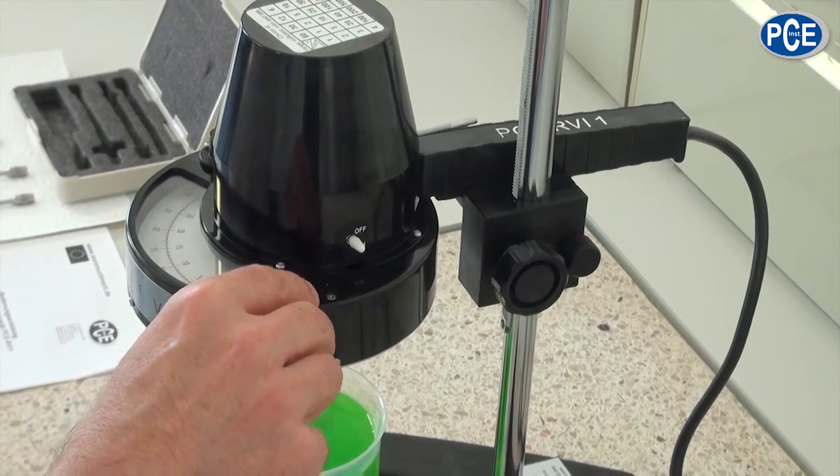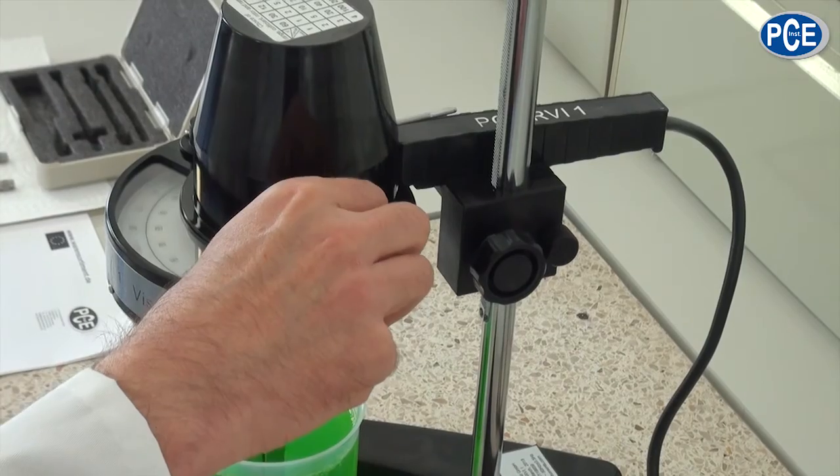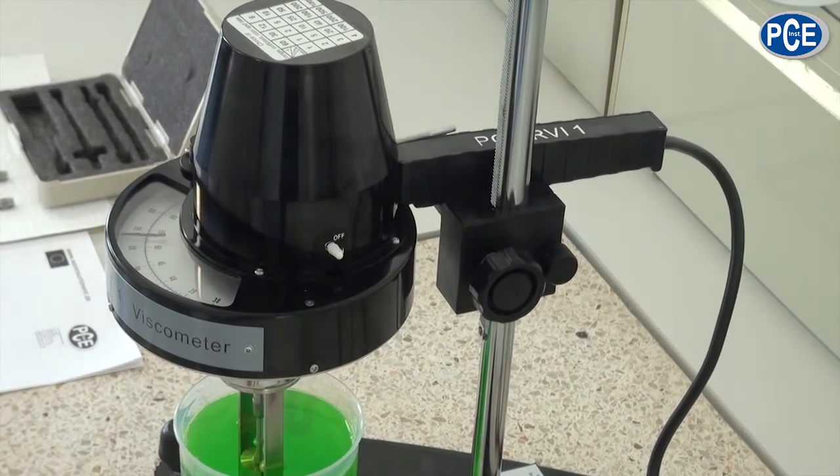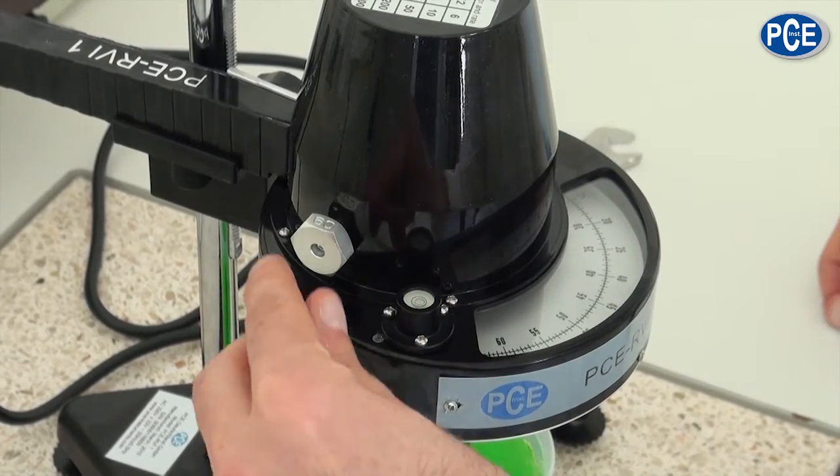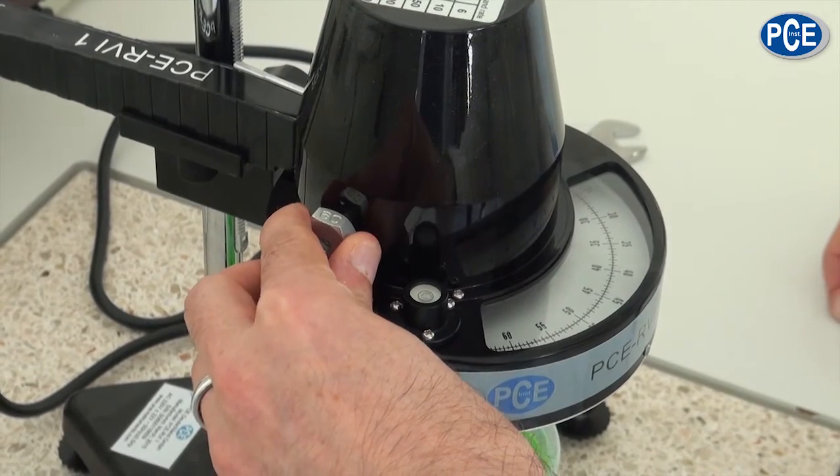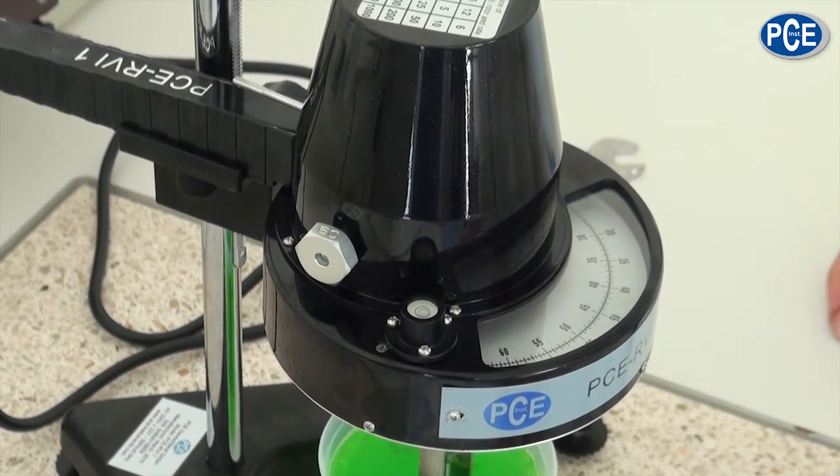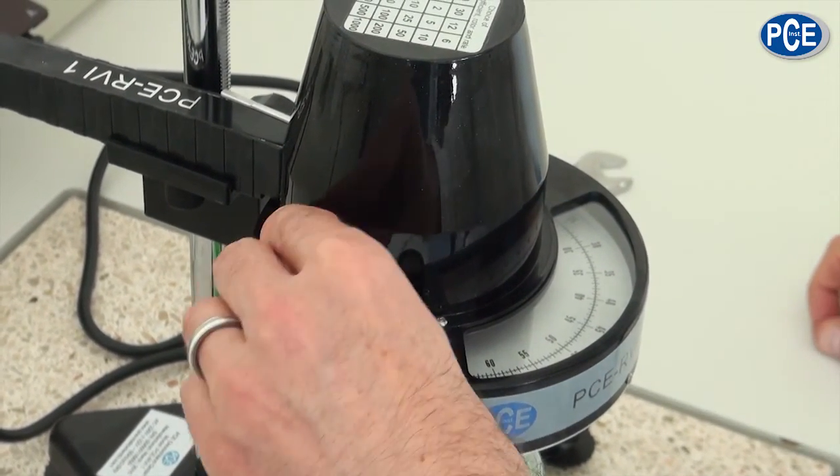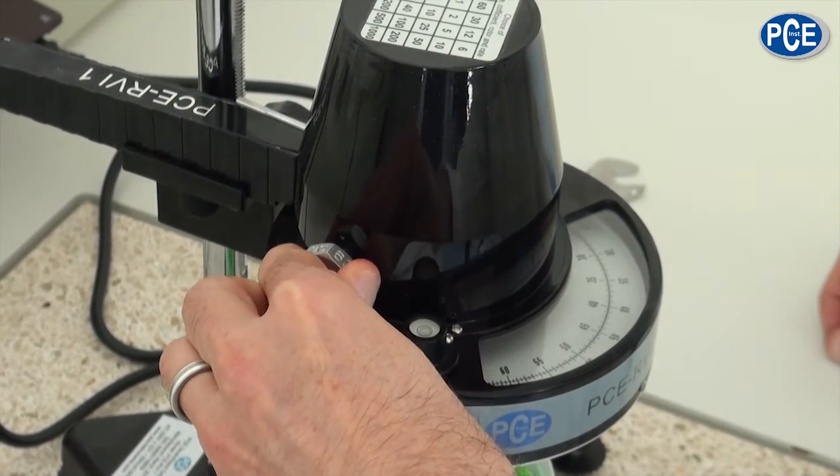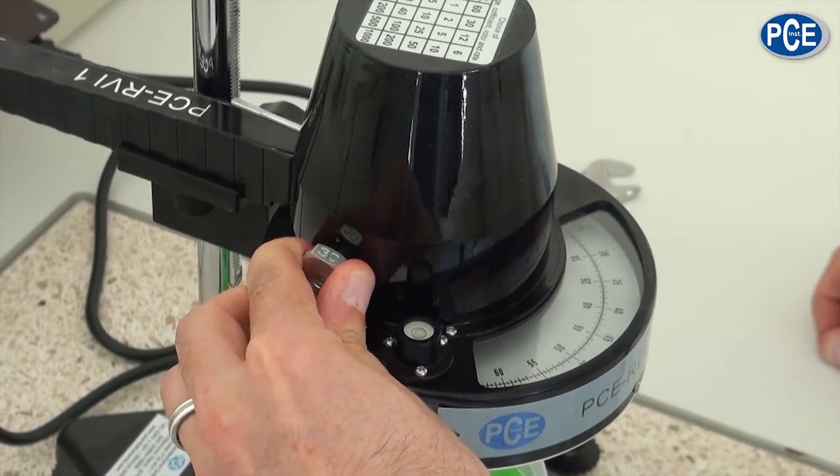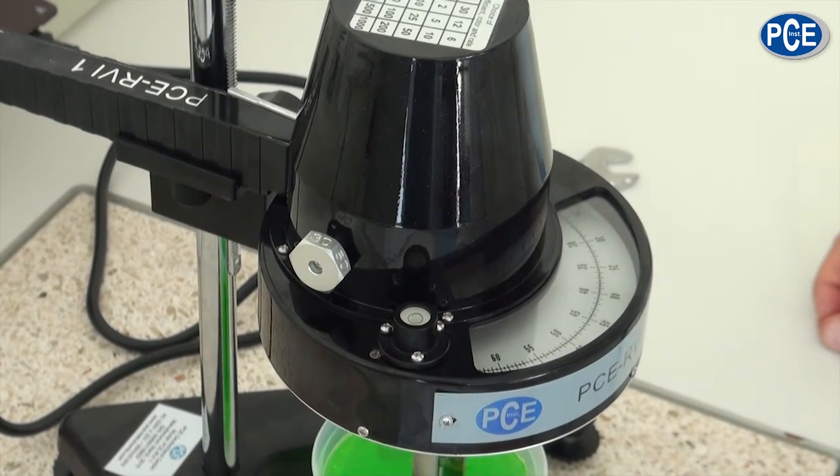I would like to show now the controls of the viscometer. On the right side is the on-off switch with the turning knob. On the left you set the rotation speed of the rotation body. Here for example 60 revs per minute, or here 30 revs per minute.